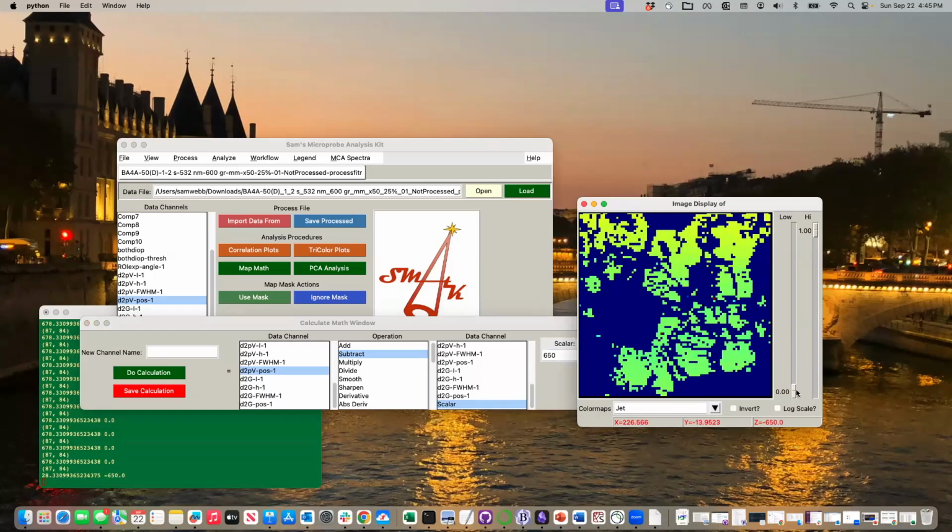See how it begins to change color at the top there, right? Let's take another 10 wave numbers off of that. And that shows you the shift there between the low and the high. And so the question is, what does this really mean, of course?